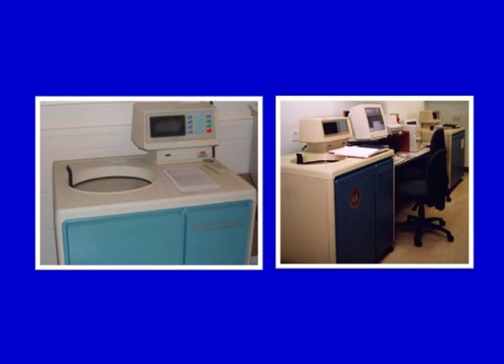So, there needs to be a particular type of rotor and a particular arrangement so that the optical system can be put in for real-time analysis as the operation is going on. A typical analytical ultracentrifuge looks like this, with all the controls, and it also contains an optical system here. These are just two representations of that.